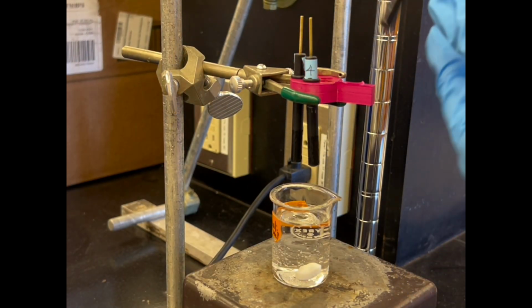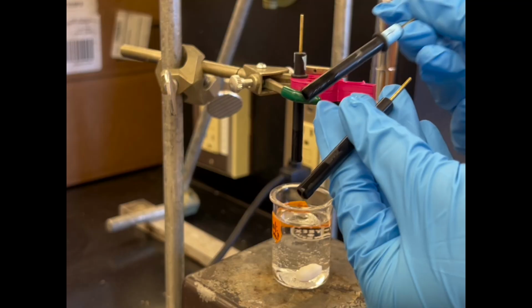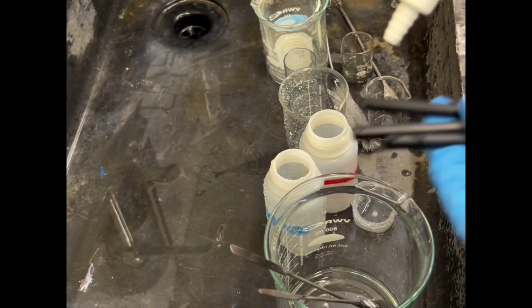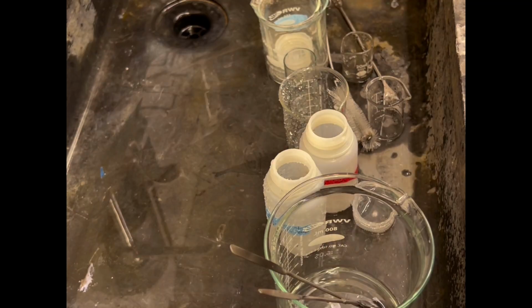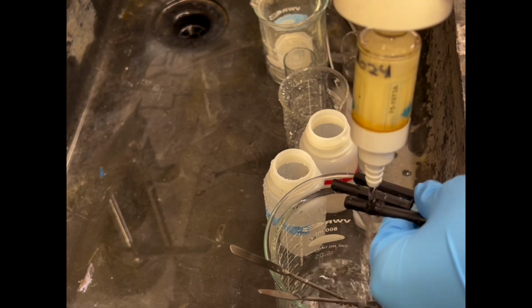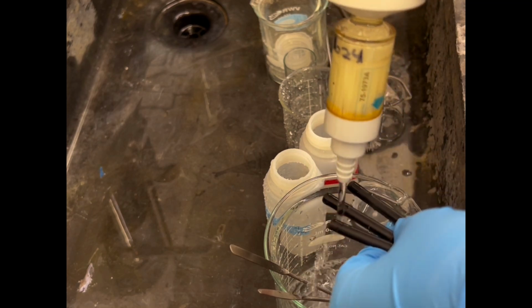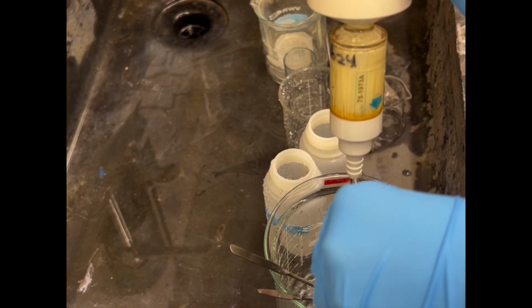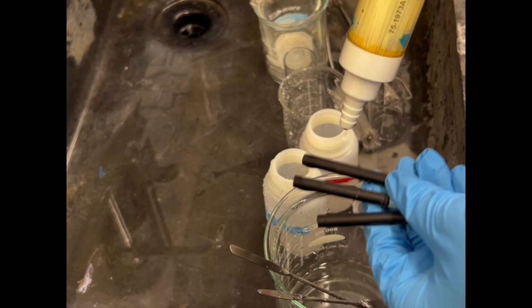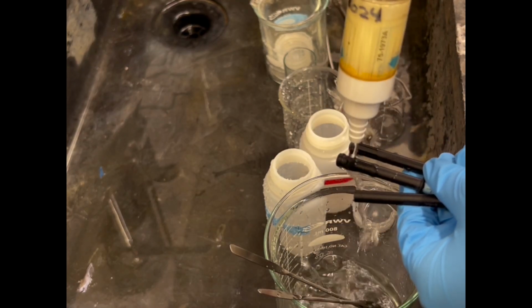When 20 minutes for the template removal is up, we take all the electrodes and rinse them with pure water and collect the waste water in the waste beaker. And this time we will dry it with nitrogen and then put them back on the plastic cell.